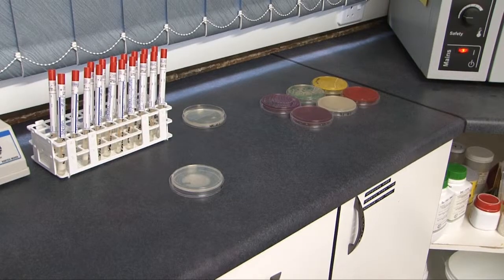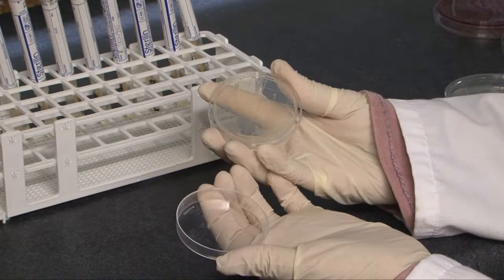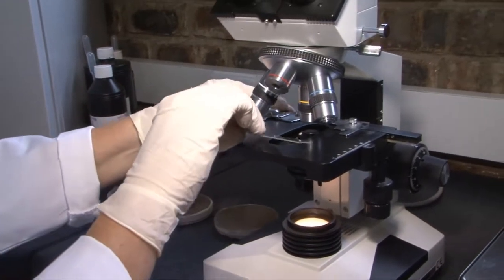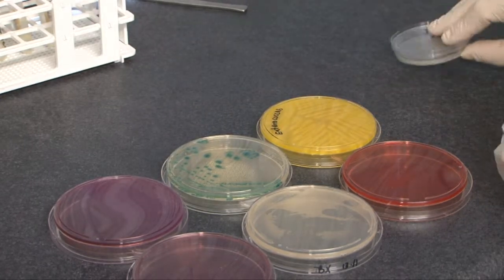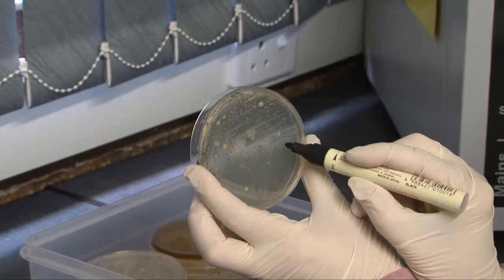The advantages of using a swab over a contact plate for surface testing are: the laboratory can test a swab for various different pathogens, whereas on a contact plate you are limited to a total bacteria or fungal counts only.